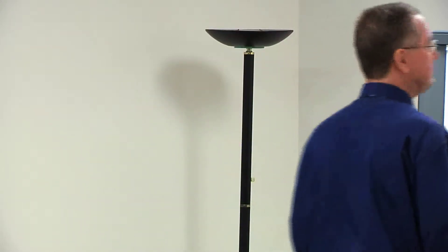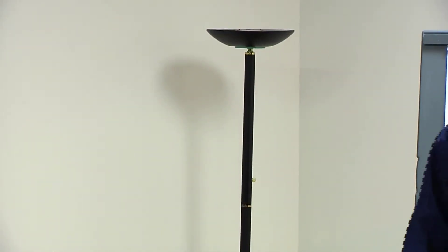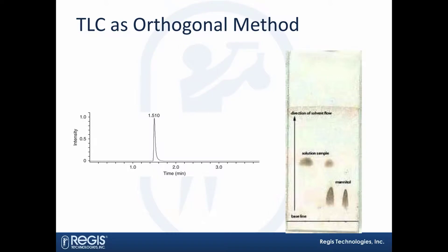Here's an example — I actually have real data in this talk right now. This is an HPLC chromatogram showing one component, and the middle lane of the thin layer chromatogram shows that there are two components. So that's just an example of something you could have missed.